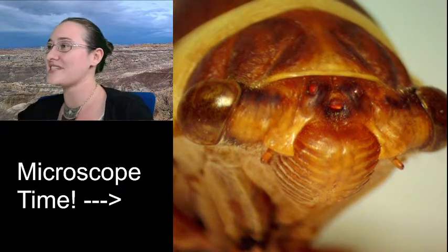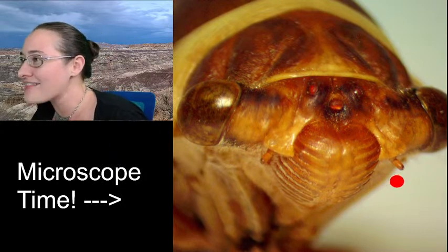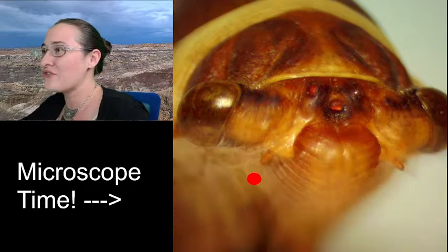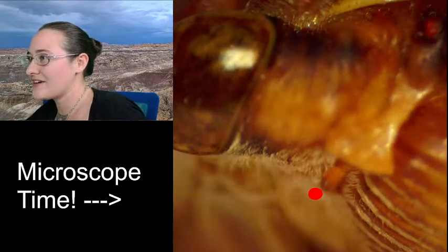All right, so you can see its eyes, you can see all three of its ocelli from the front, and that little segment right there, that's its antenna. Right here and right here. So if we zoom in really, really far, we'll look at this side's antenna. There it is.